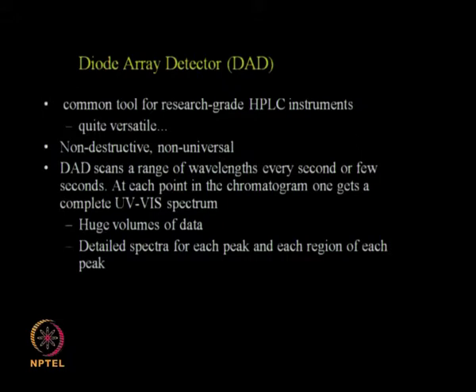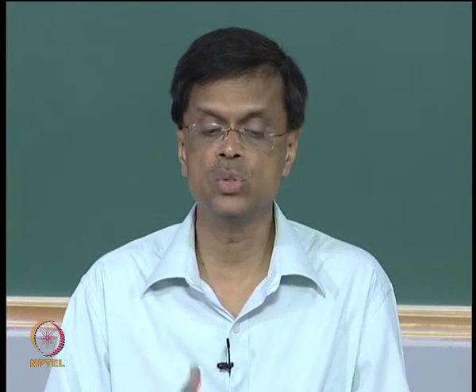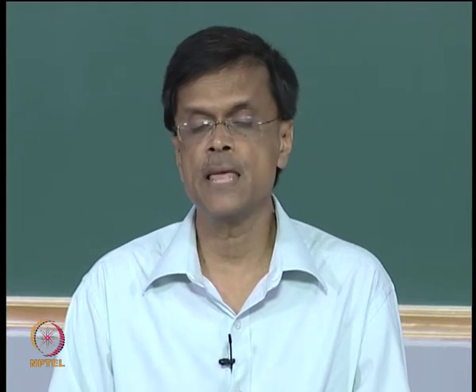I will scan the entire wavelength range, and from that I will know the lambda max of that compound. But the data you are going to get each second, if it scans the entire wavelength range, is huge volumes of data actually. That is the main disadvantage, but it is ideal for research purposes. So single beam is ideal for routine quality control, whereas DAD is very good for R&D type of work. Again it is a non-destructive type of technique. That means after the experiment we can again collect the solute back and use it for some other analytical purposes.